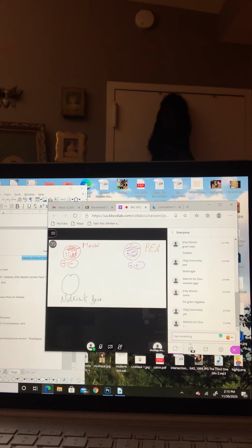Here I said you have two microorganisms, one Gram-positive and one Gram-negative. That's why you get pure colonies from each plate, the MacConkey and the PEA, that are selective for Gram-negative and Gram-positive.